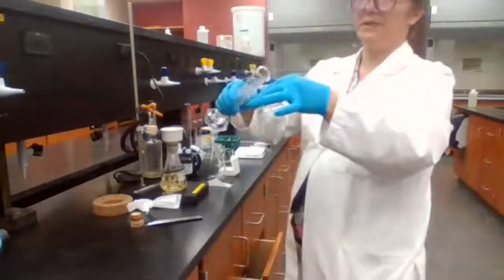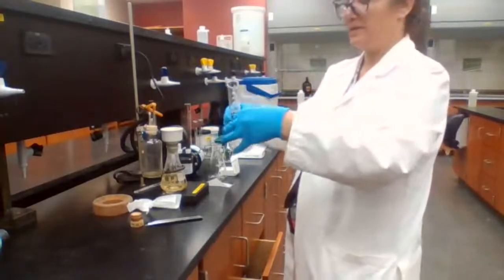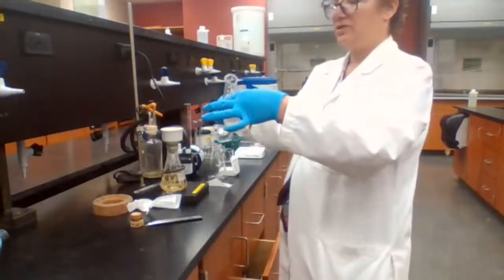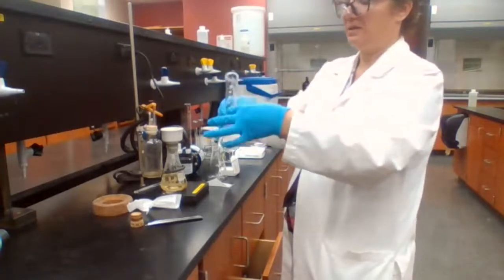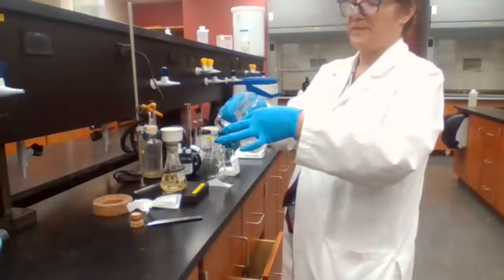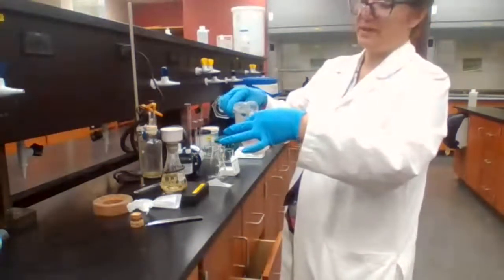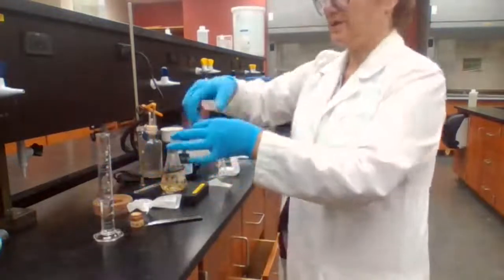Going to add 50 milliliters first. See if the two layers are forming. It should dissolve and it should form a second layer. If the second layer doesn't form, then I have to add more of the sodium hydroxide.